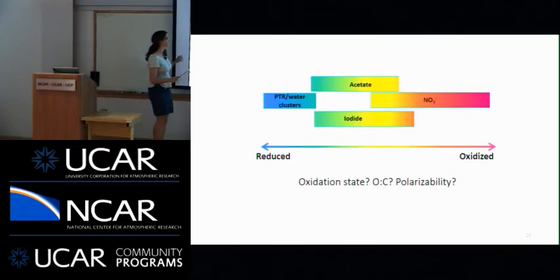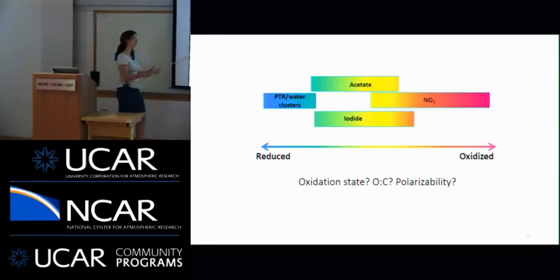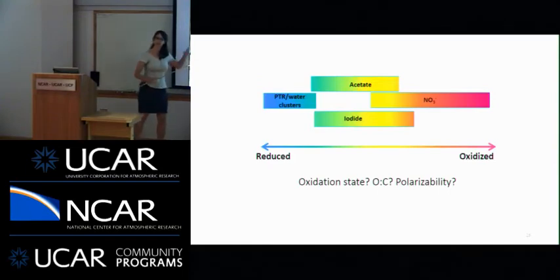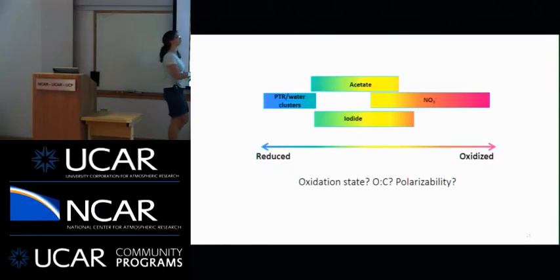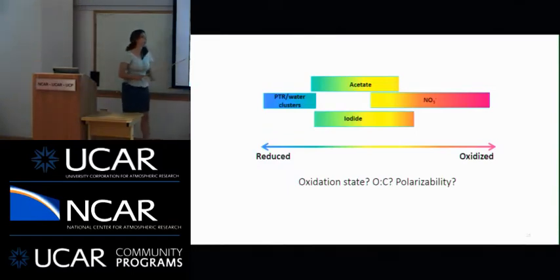But if we look at these figures and we go back to our image of how these different ionization techniques work along our axis of reduced to oxidized, or perhaps it's oxidation state or O to C or polarizability, nobody seems to really know. But if you choose your axis and you think about these different types of reagent ions: PTR does an amazing job measuring hydrocarbons, and it measures quite a few of the lower oxidation state, but slightly oxidized molecules. Acetate seems to cover a fair amount. I- is perhaps slightly more oxidized molecules than acetate, and then nitrate is quite an impressive reagent ion. It seems to measure quite a large variety of molecules.